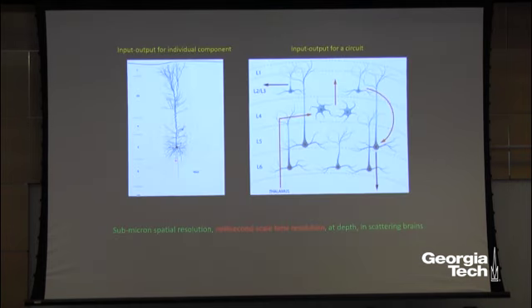So finally, before I end my talk, I just want to say that now I've showed you that with adaptive optics, we can have very high spatial resolution, even deep inside the brain. We can image them at depths. We can image them at pretty high temporal resolution that is sufficient for us to capture all the calcium activity, which is nevertheless a kind of a low filter, a slower version of the actual activity event.